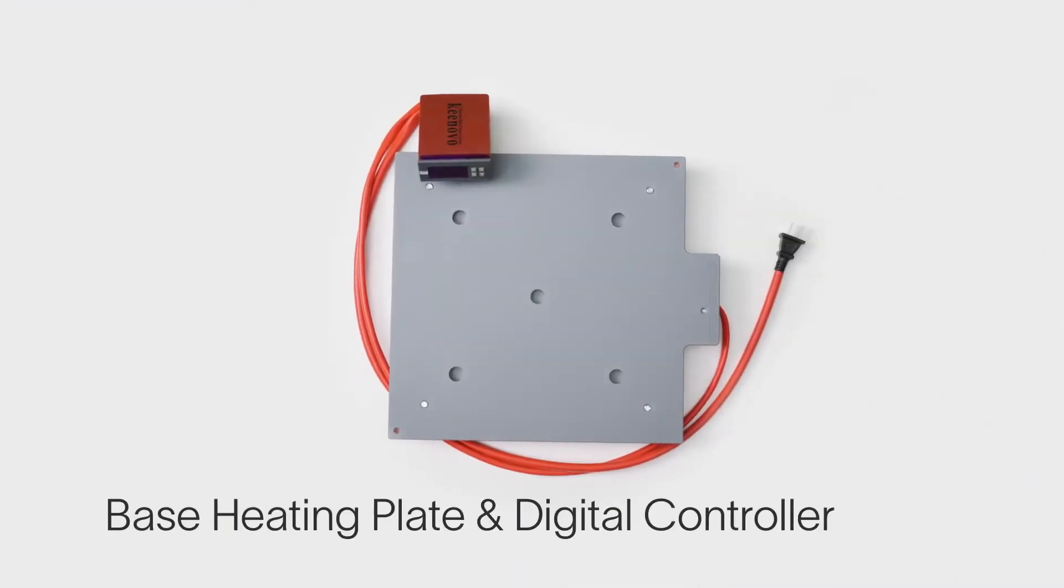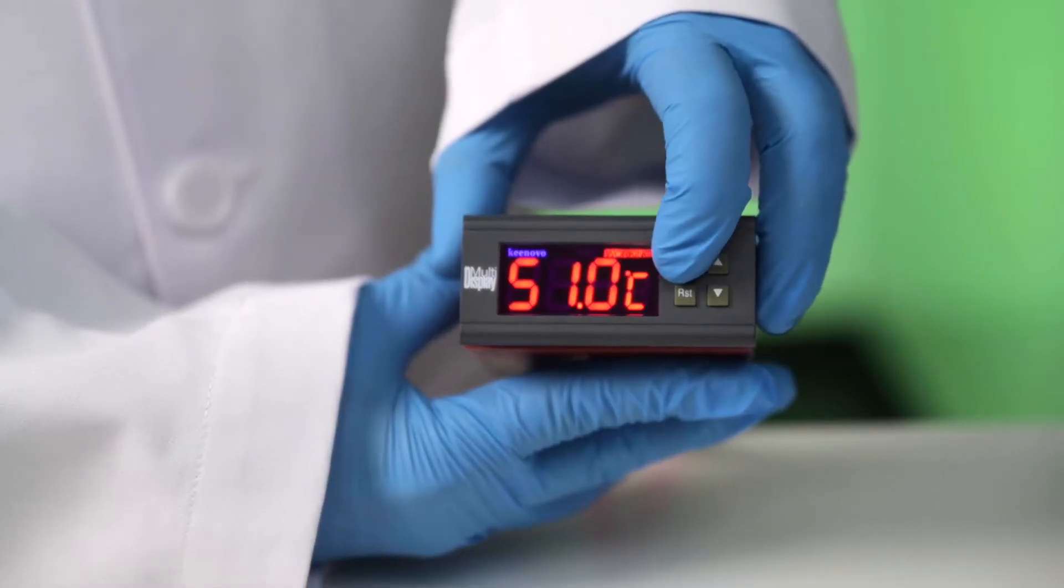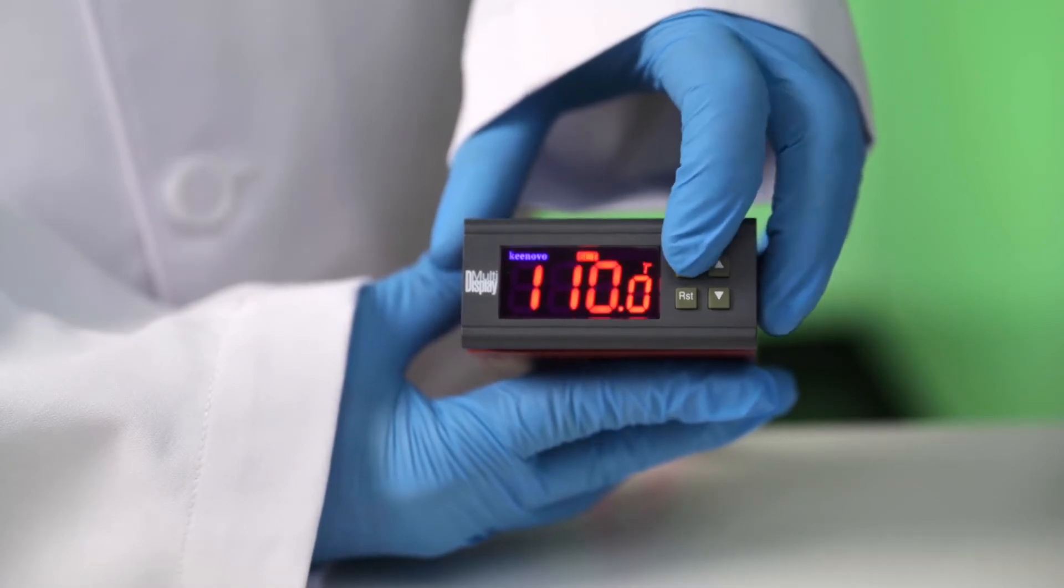Let's start with the base heating plate. You will find setting the temperature with the digital control a breeze. With its fast heating capabilities, your team will be baking in no time.